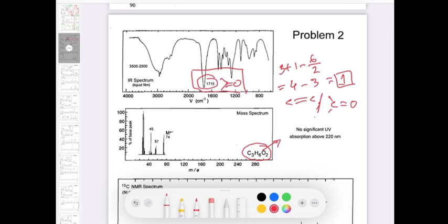So you can clearly see that there is a band here from 2500 to 3000, and it's the ugliest peak. So that is actually the carboxylic acid OH band. Okay, remember it is not alcohol, that is the OH from the carboxylic group.